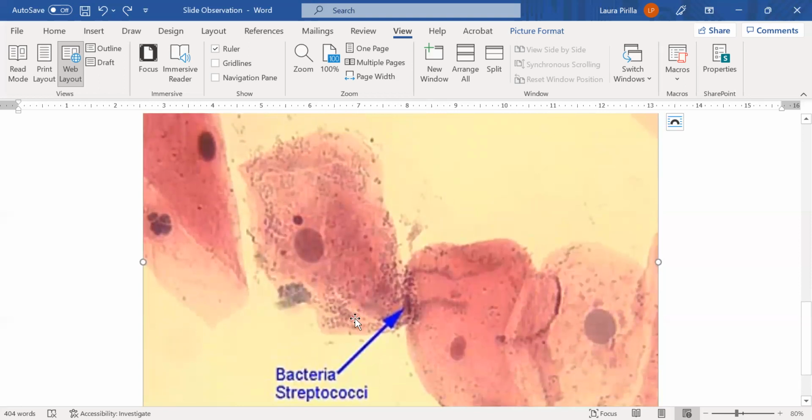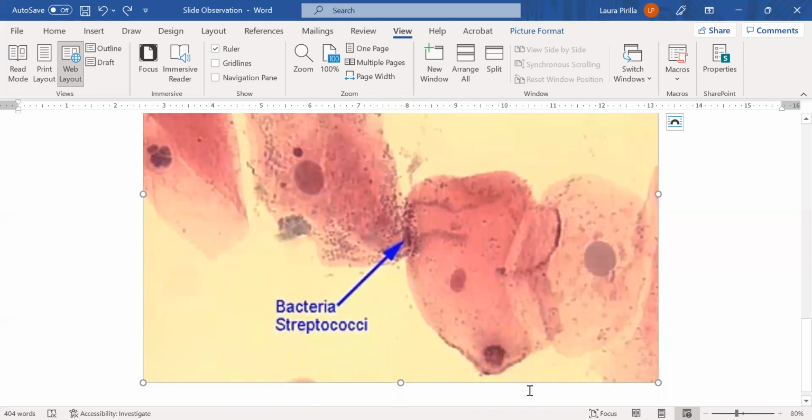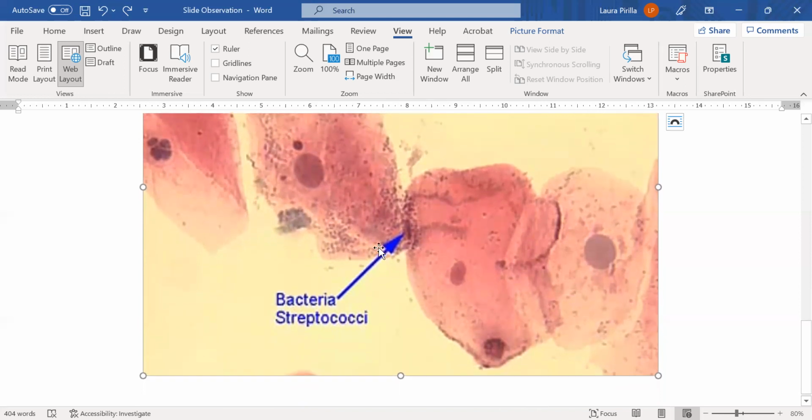And the reason that you see multiple dark spots in the image is that the dark spots represent the nucleus in those cells. And if you see more than one spot on what looks like a structure, that cell might just be getting ready to divide.